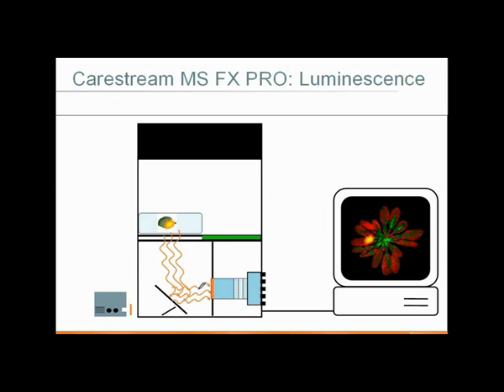In luminescent mode, you have a chemical oxidation, typically from an oxidative species like luminol, which can be excited by hypochlorous acid, hydrogen peroxide to some extent, although it requires high concentrations, as well as systems like luciferase, where you're oxidizing luciferin within a structure. That allows you to look at things like promoter activity and protein-protein interactions.